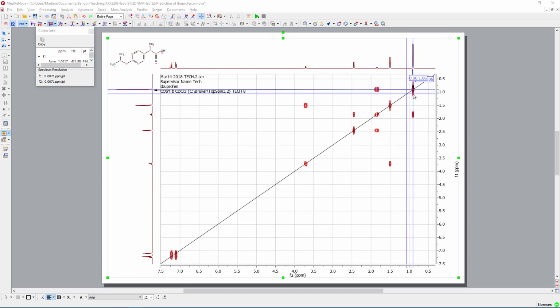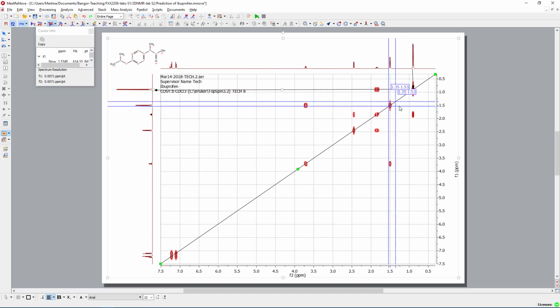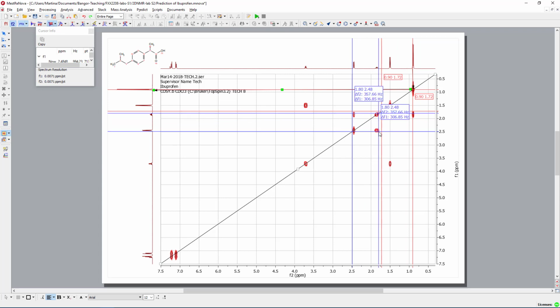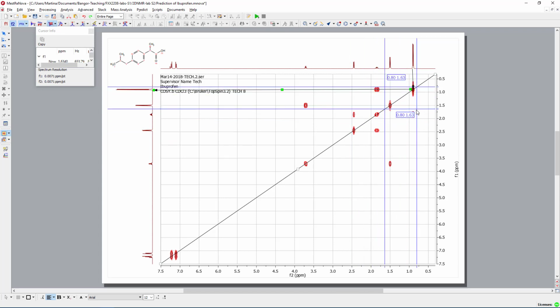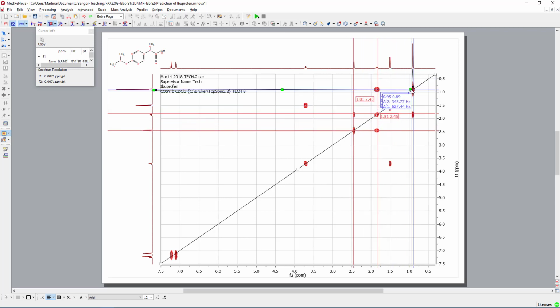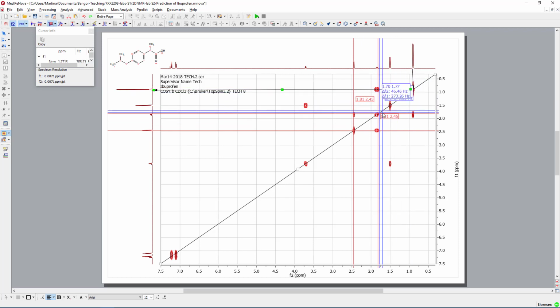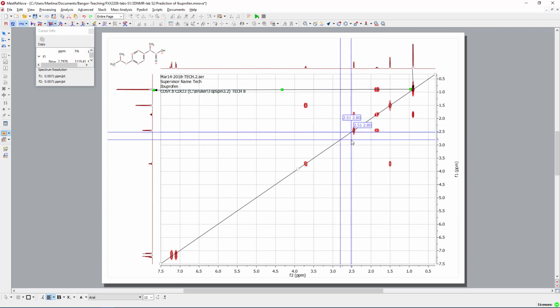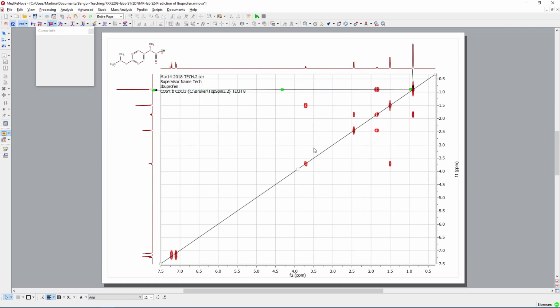I showed you earlier in the video that you can just press down the shift key and then you get the square. Unfortunately, it doesn't work perfectly while I have the Camtasia software on. But what you can do is move to the next square, and by this you can see how the signals are connected. It's a bit fiddly, and it works a bit better when you don't run Camtasia in the background, but play around with this and see how you get on. So this is one of the things I wanted to show you.